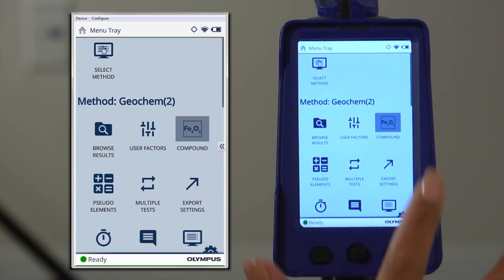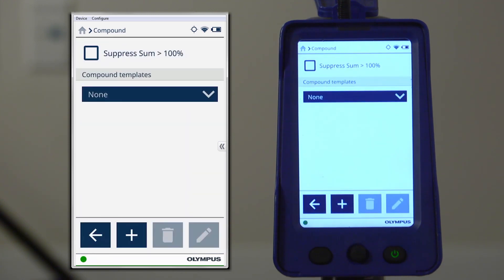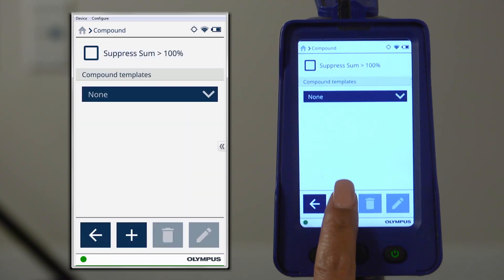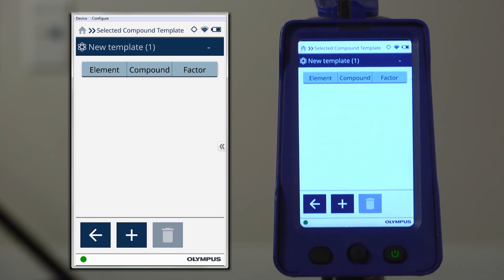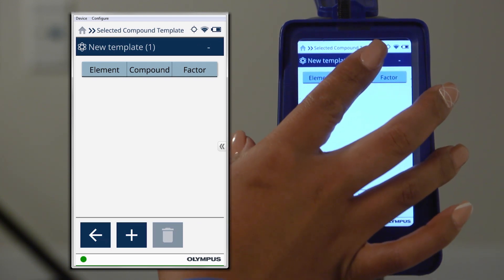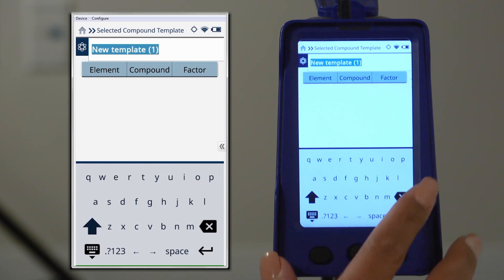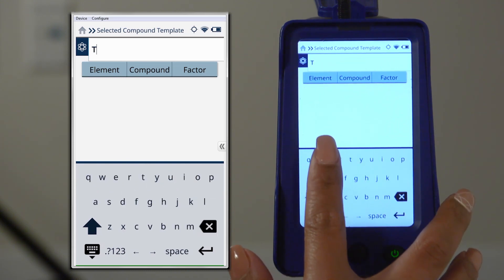To create a new compound template, press the plus icon. Each template can contain multiple compounds. Press and hold New Template to rename your new compound template.